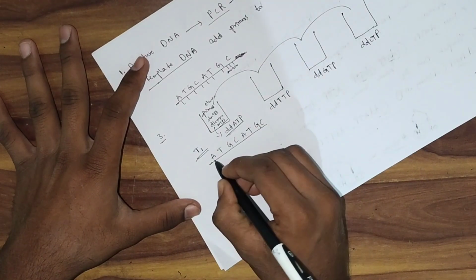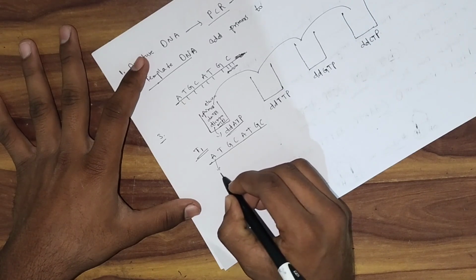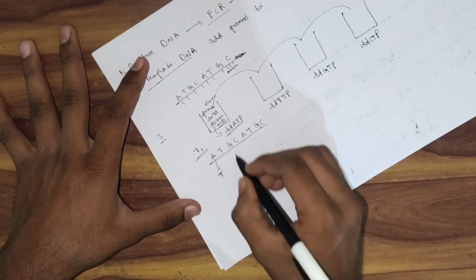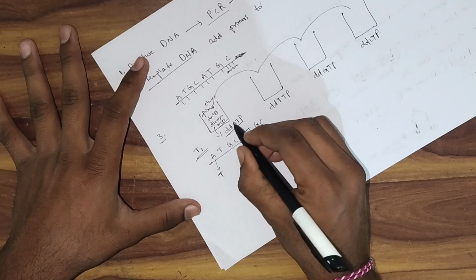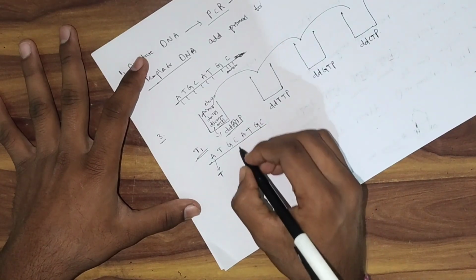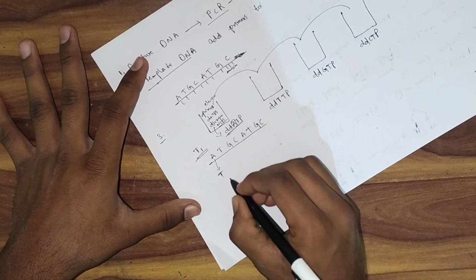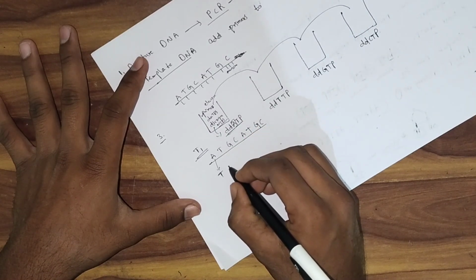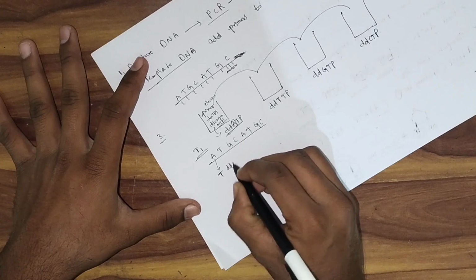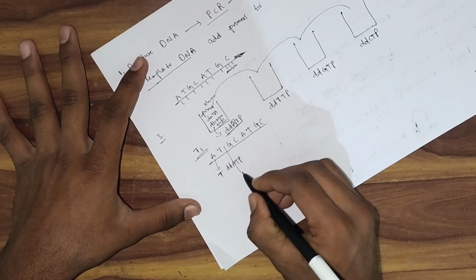What is the opposite of adenine? It is thymine. What is the opposite of thymine? It is adenine. If ddATP is added as complementary to it, then the chain will be stopped.